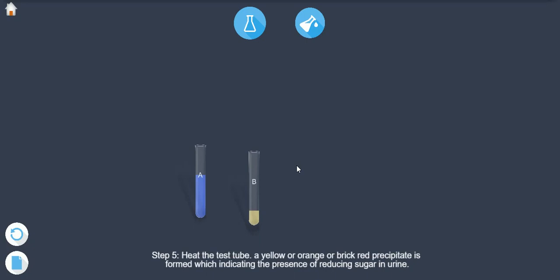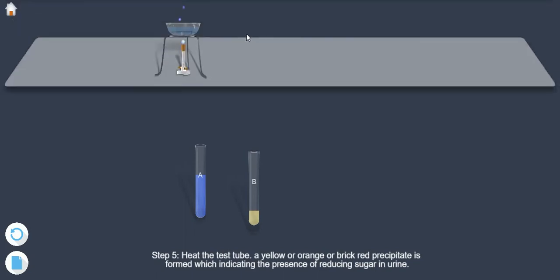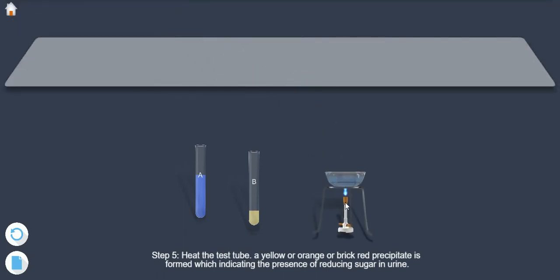Step 5: Heat the test tube. A yellow or orange or brick red precipitate is formed which indicates the presence of reducing sugar in urine.